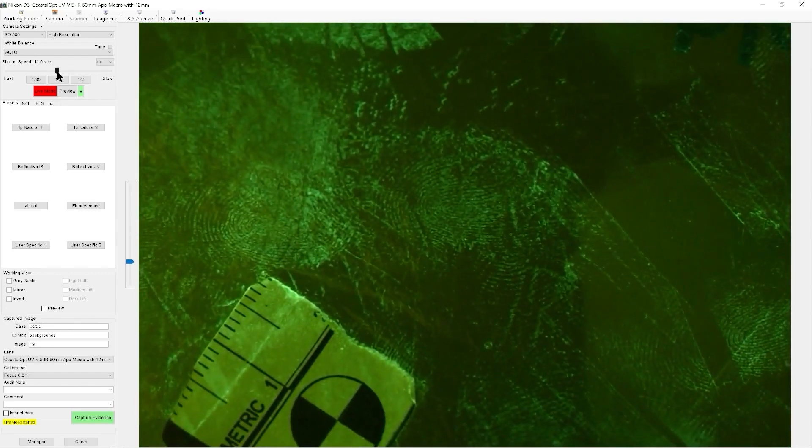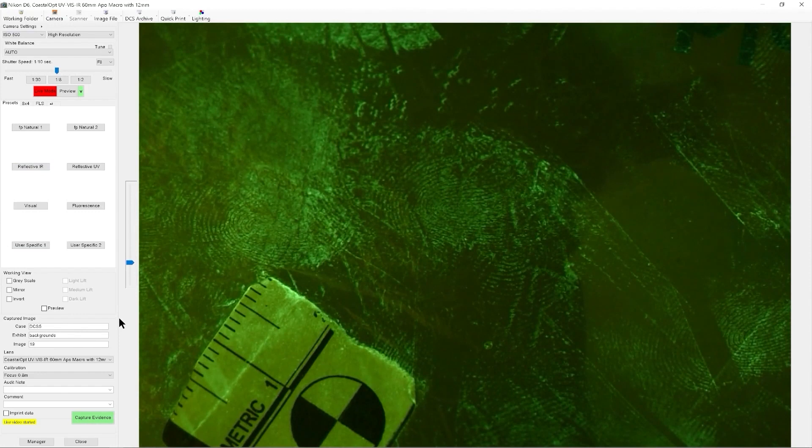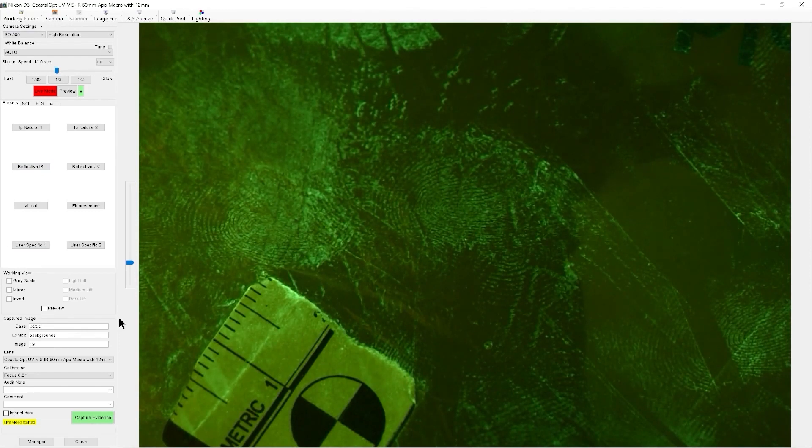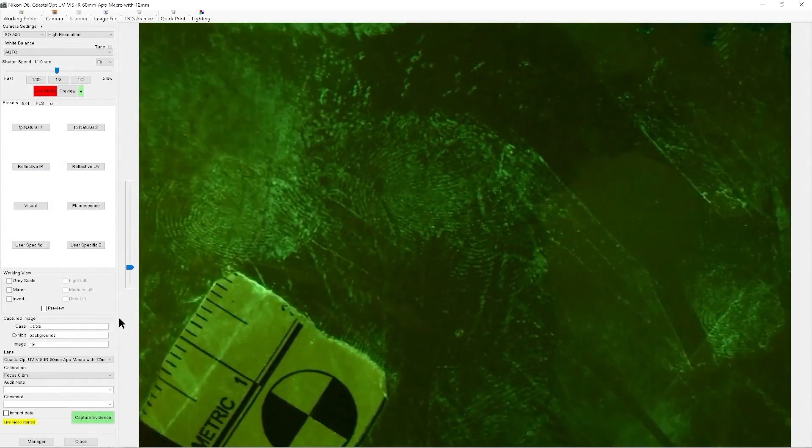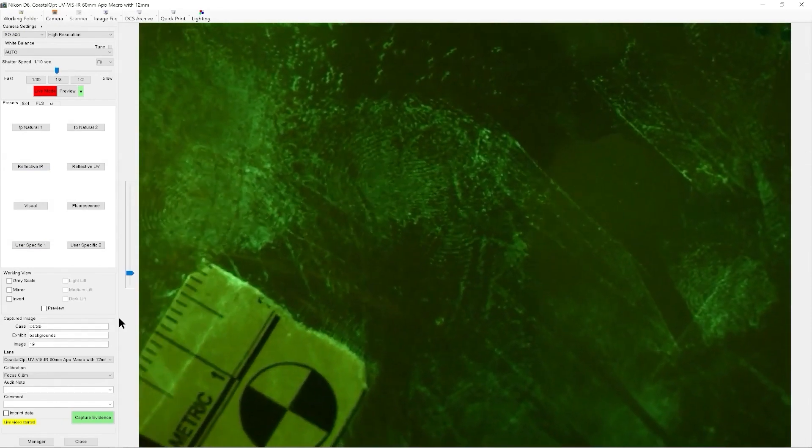So wherever we find our fingerprints, it's simply a case of make sure the surface is flat. Remember depth of field is very limited with macro photography.